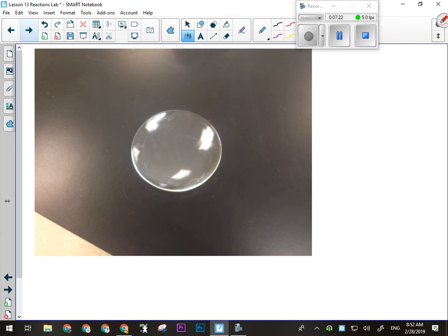So when you come up to the front and you're looking for pair A, you'll put one of the ingredients of pair A in the watch glass, and you'll take the other ingredient back to your table in the eyedropper. All of the solutions have eyedroppers in them, actually two eyedroppers. Take the solution back to your table with your thermometer, and mix them together. The thermometer needs to be in when you start the mixing, that way you can observe any temperature changes that occur. Everyone follow?